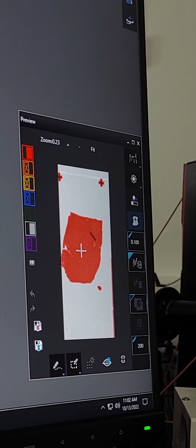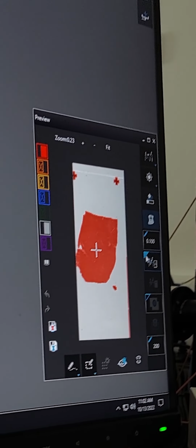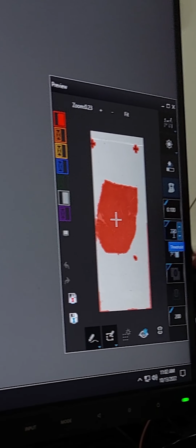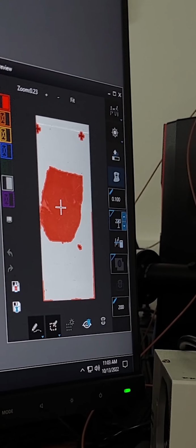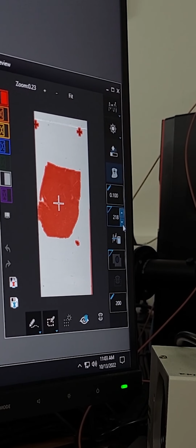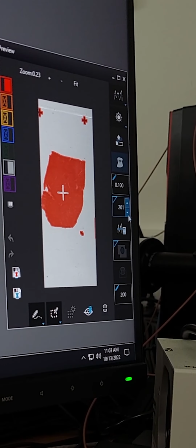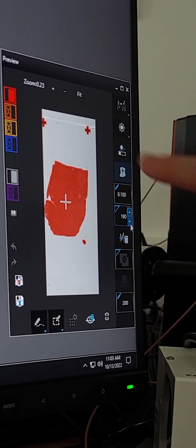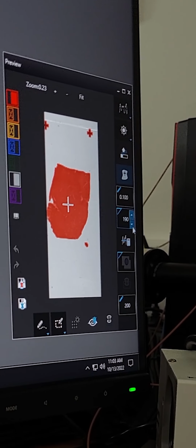If you are not happy with the area that is selected, you can always adjust this threshold. This threshold goes from 0 to 255, so 8 bits. This is an 8-bit picture. It is a simple threshold, nothing more. As you lower it, you will lose the pixels that are not that dark, of course, and that's it. But of course, for example, these patches are always going to be included with the threshold.